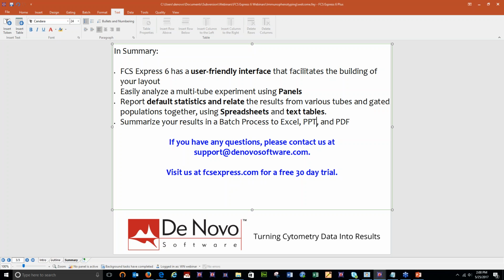We do have a full webinar on batch processing as well as a short 3-minute video on our website about batch processing. So I didn't go into a huge amount of detail about it, but if you want to know more, just please check one of those out.